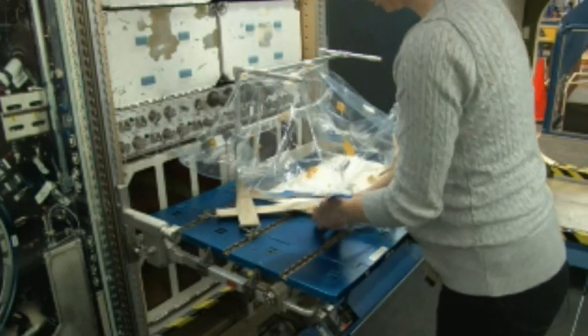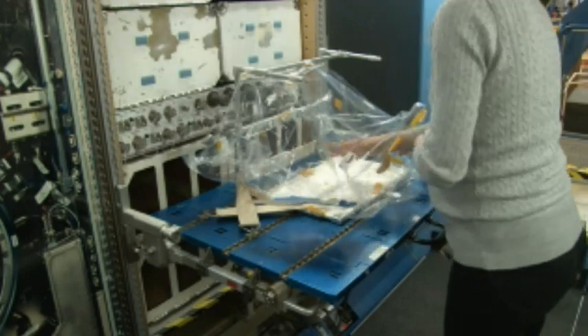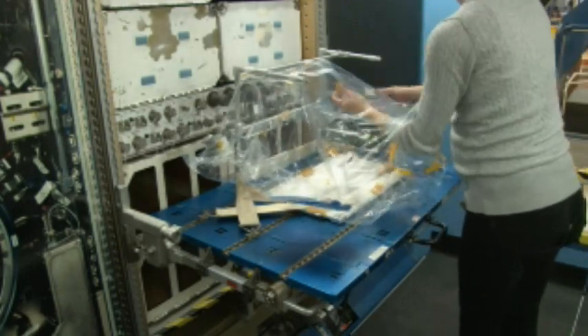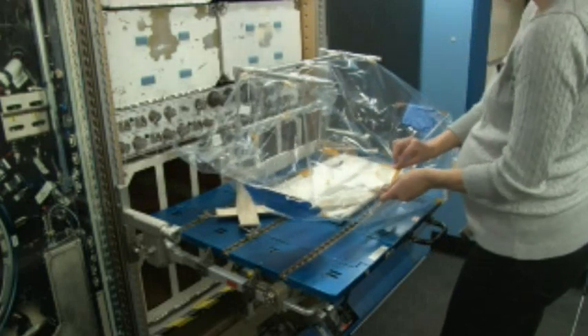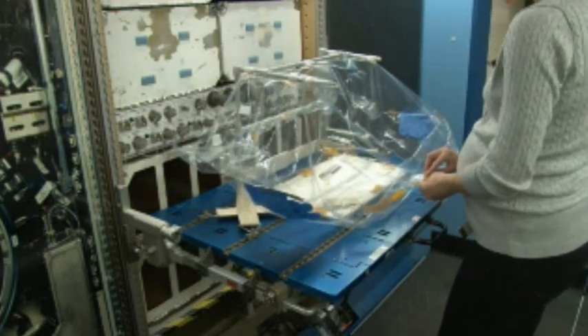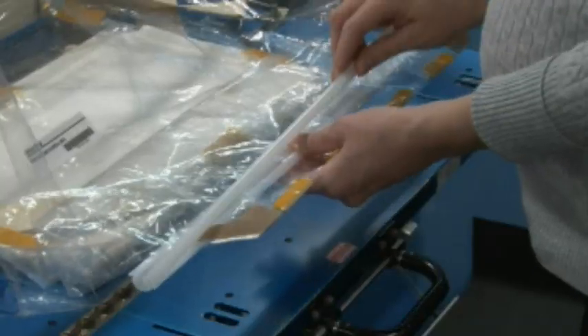Then retrieve the glove bag clip to securely close the glove bag during experiment operations. Once I mate all the Velcro on the top of the frame, the bottom of the frame, and the back of the frame to the glove bag, I remate the glove bag Velcro at the opening to align the opening flaps. Then I retrieve the glove bag clip, placing the rod on top.